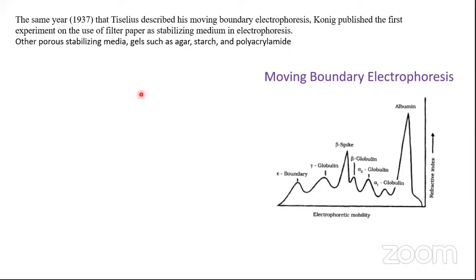Yes, any? Maybe because convection currents could not be produced in paper and it will not lead to much movement of solute molecules. Yes, that is one aspect, because the basis for incorporation of the stabilizing media here is to minimize convection currents.